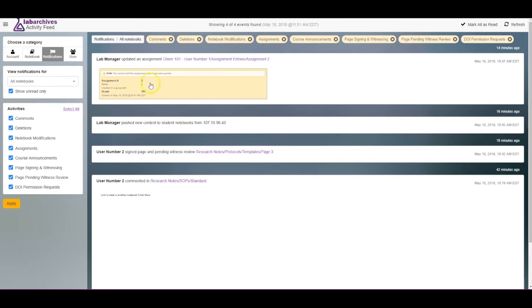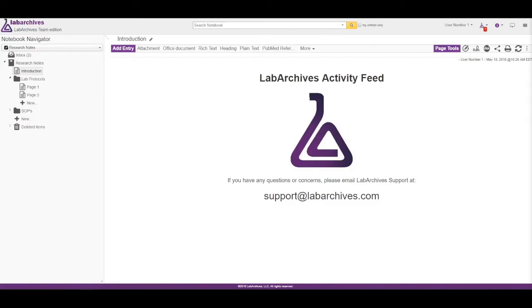If you would like to view all notifications in your account, deselect show unread only and select Apply.